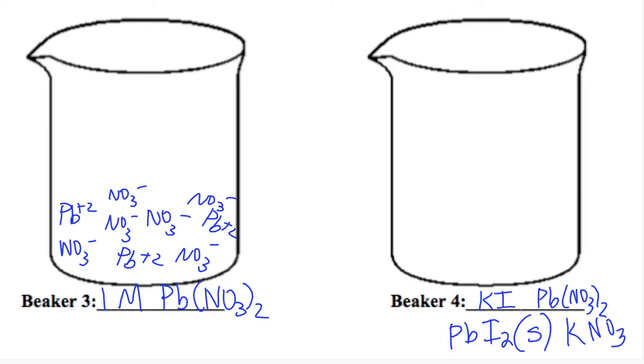What were those ions called? Potassium and nitrate, what were they called yesterday when we did our equations? Yeah, these are my spectator ions still wreaking havoc. It's kind of hard to tell, but it is a little bit lighter. Less of the bulb is lit, I can see there's more dark on the bulb. So the light is a little bit less than it was.